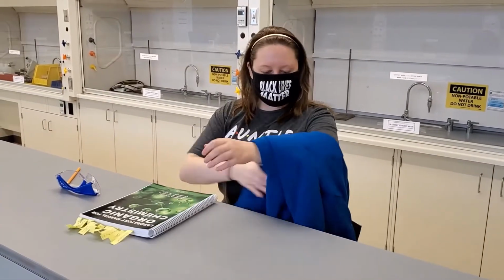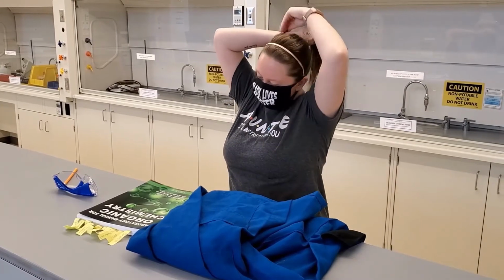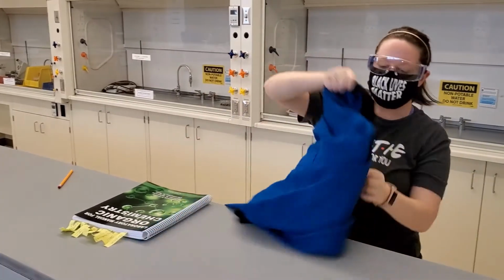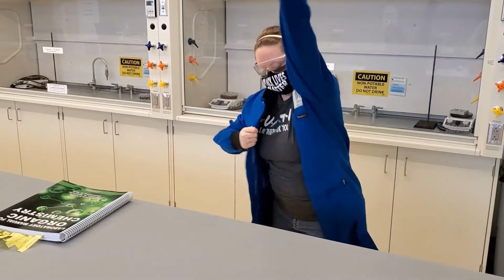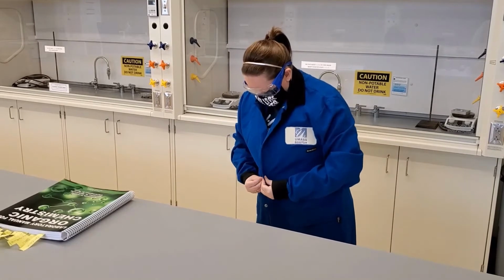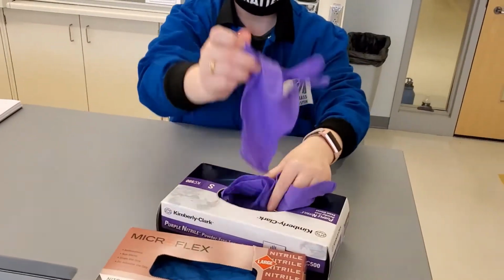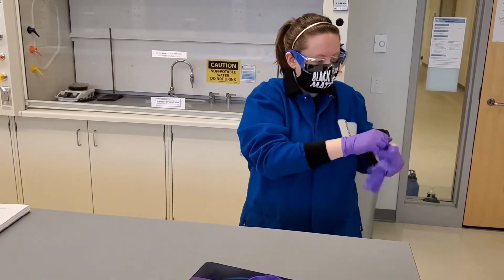On her second try, the student is now ready for lab. She ties up her hair with hair ties so that it is out of her face. She puts on her lab safety goggles and she puts on her lab coat, which is fire retardant and is graded for lab chemicals. The student also double checks her list of chemicals for today's lab and puts on her lab gloves.